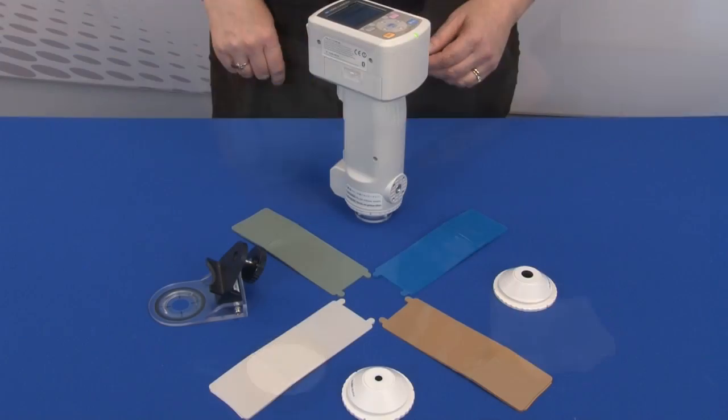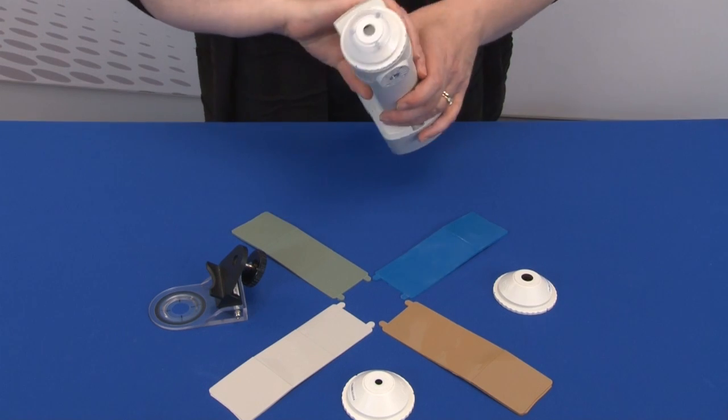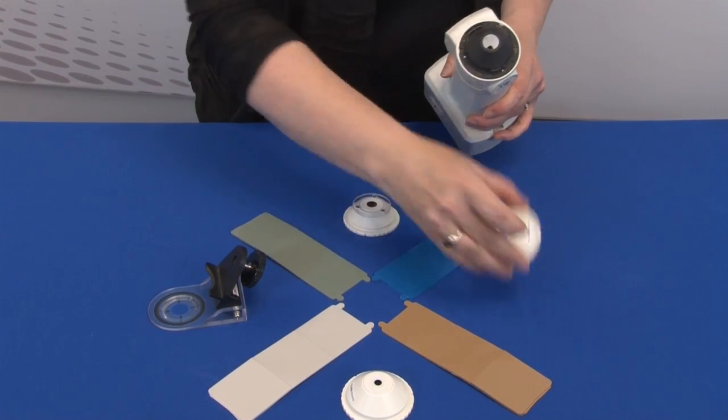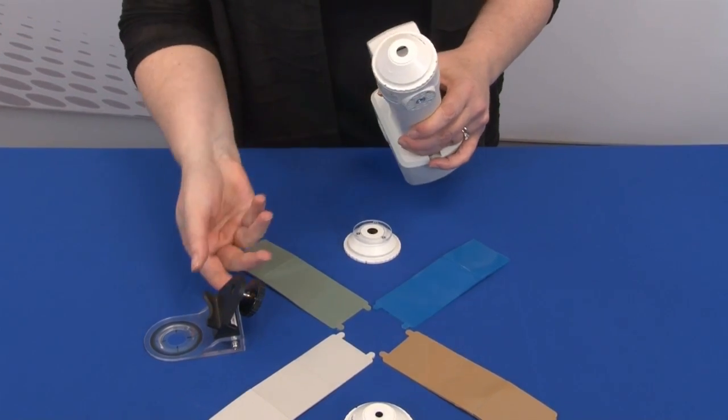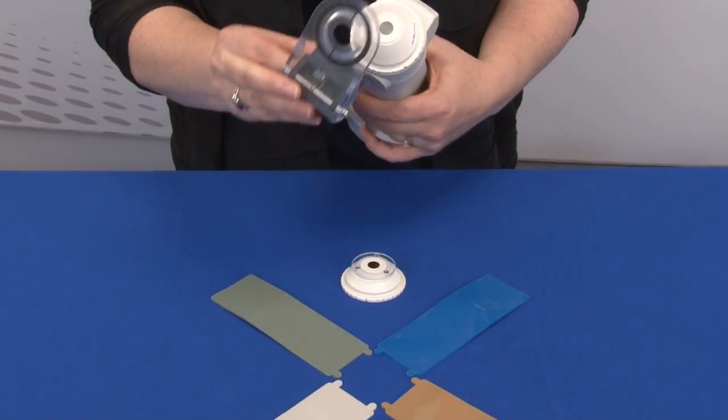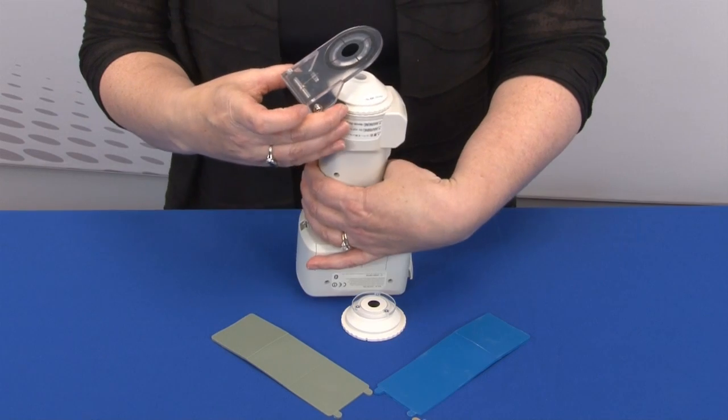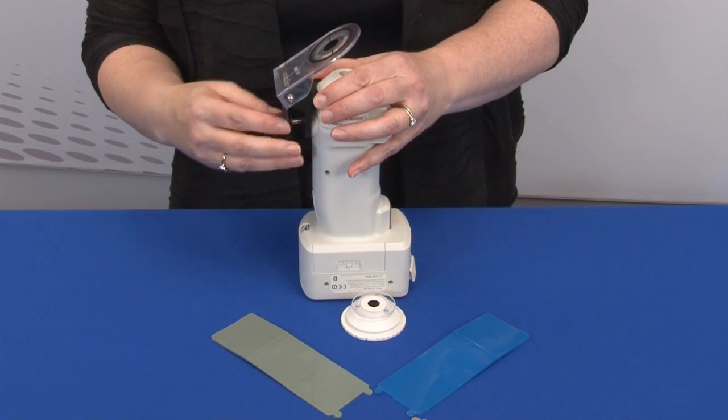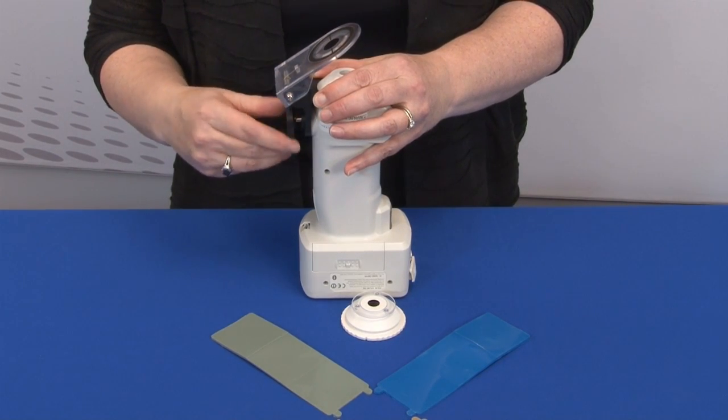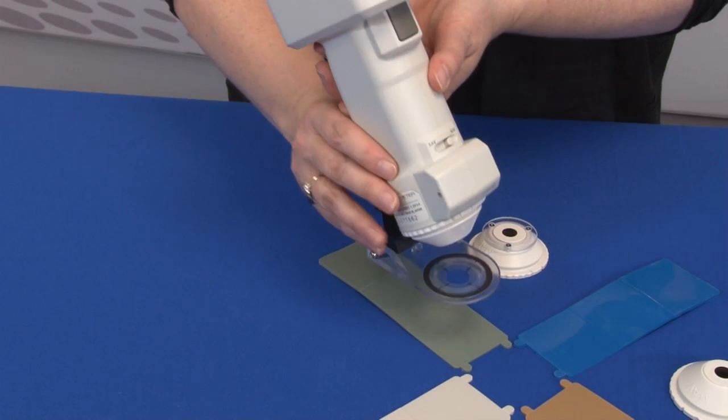Next we will look at the custom pivoting base with a 3mm and 8mm target mask. This accessory is recommended for the measurement of flat samples. The large base plate increases the stability and the marked target area provides precise positioning. Let's take a look at how the pivoting base accessory functions.